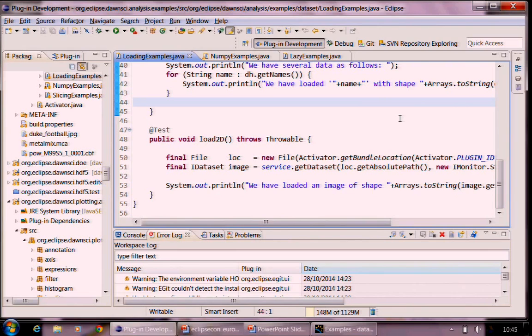What we're trying to do is make sure this doesn't really change. We might adopt some of the Eclipse 4 designs, but basically the idea of having a plotting system and a trace and an IDataset doesn't change. It's long-term design. And that's actually from Pio's group as well, where they want to write code and not know about how the data was loaded and how it was plotted. They want to be isolated from that because they want to get on with acquiring data on the beamline. So actually inside our company we have that requirement going forward. So yes, I think we will have an Eclipse 4 target, but it will still be working mostly this way, or with improvements from the community.